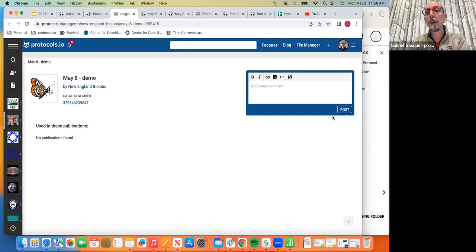It is my impression that you cannot edit it. But if you type your email address, I'll get back to you. Or you can send me your email address via email, and I'll get back to you. But I don't think that you can edit it from what I can see now. Okay, I have your email address now.